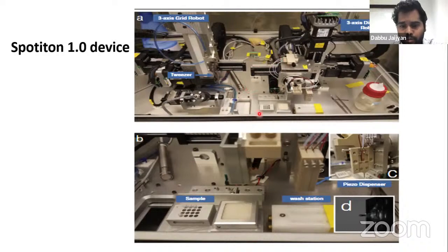So I will show a video of this. Here you have the sample station where the piezo tips come and get the samples, and then the piezo tips are washed, because we don't want the sample to get dried onto the tips, which can block them. And then after washing, the tips will be dried over here. Before going to the detail of the method, I would like to show a very small video, about a 2-minute video.